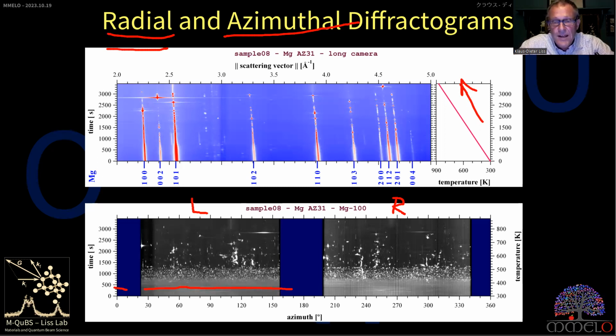And eventually here, we're still working in a two-phase field, but eventually here, we are going to pure magnesium phase, and then we get a lot of grain growth, so a lot of coarsening on the diffraction rings. We can look into that in detail, but because of time, I have to hurry on.